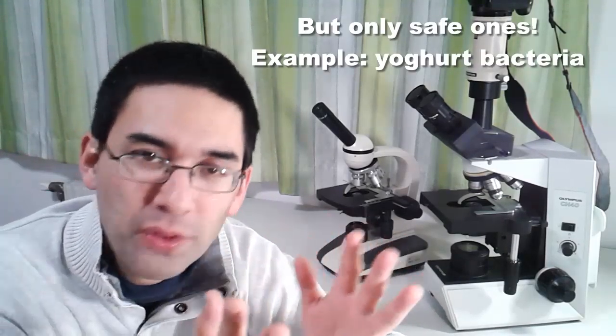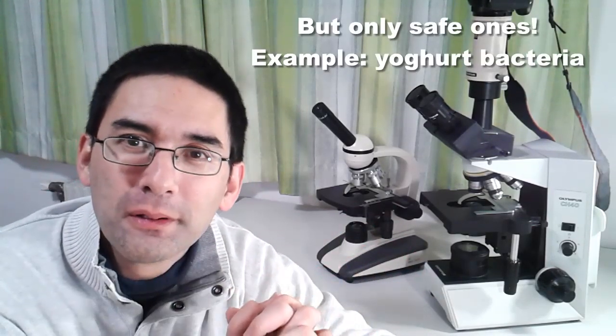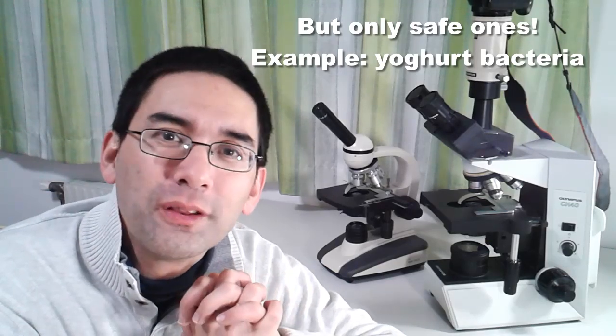So my advice would be: sure, if you're interested in observing bacteria, please do that, obviously. But don't overlook the other things that you can observe with a brightfield microscope. I think there are more interesting things to look at. So don't be disappointed. That's essentially what I wanted to make clear here. Don't be disappointed if the bacteria that you see with your microscope are not that totally exciting.